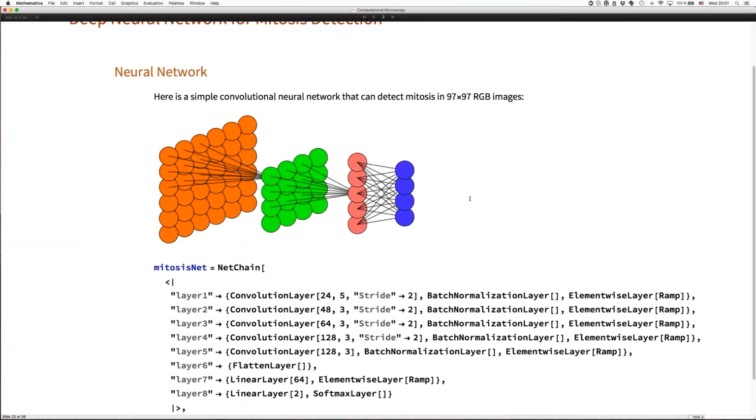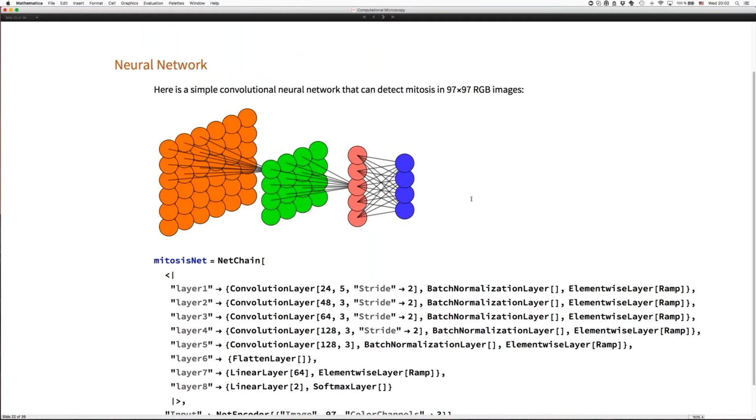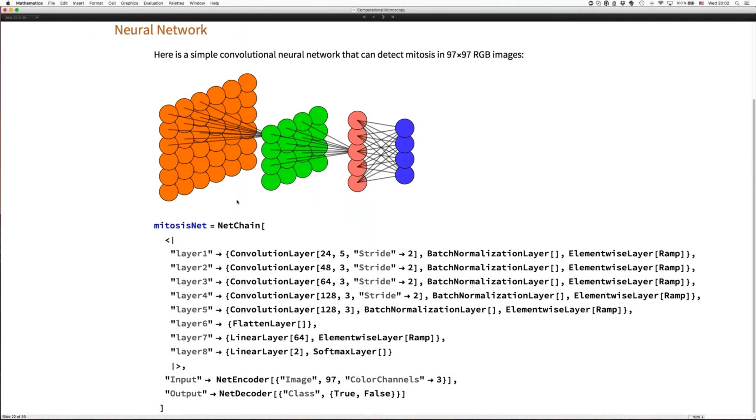Well, we construct a neural network, because neural networks have proven to be a really versatile, flexible and powerful way of constructing classifiers. Classifiers that not only classify a feature space, but that also, in very many cases, generate the features themselves. By that I mean you apply the neural net directly to the data. You don't have to run some kind of feature filters in between. You don't generate a feature space. That's all done within the neural net itself. Now, neural nets, in order to do so, tend to be models with plenty of parameters.